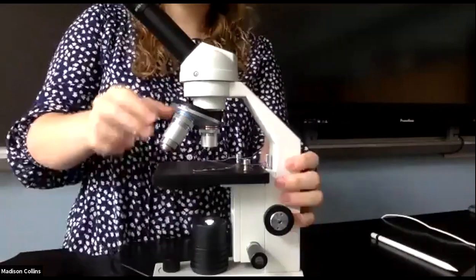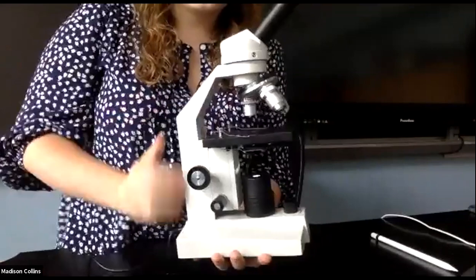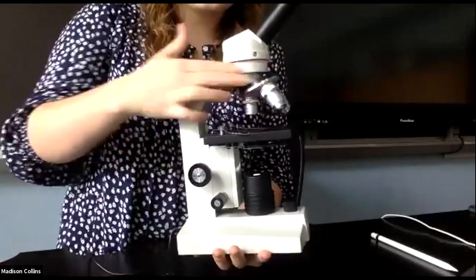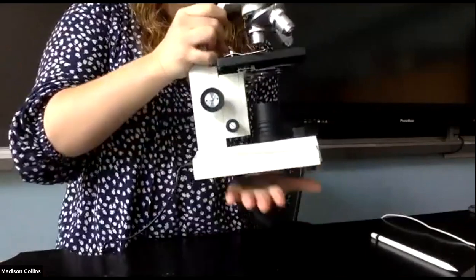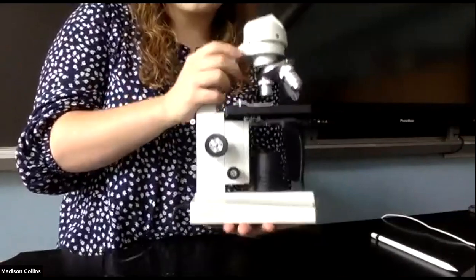All right, this is your arm of the microscope. And this arm is what connects the base to the revolving nose piece. Okay, so this holds the top half of the microscope together. And this bottom part right here is called the base. This holds the entire microscope together.